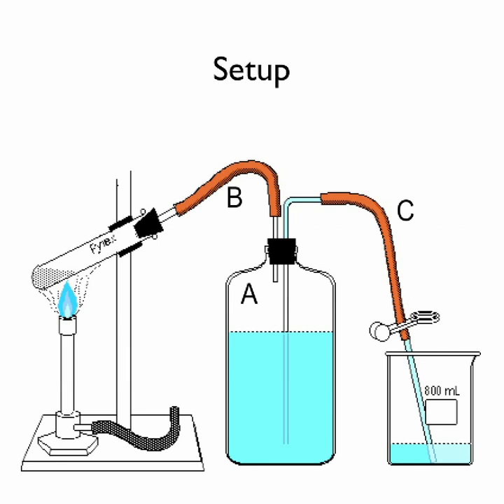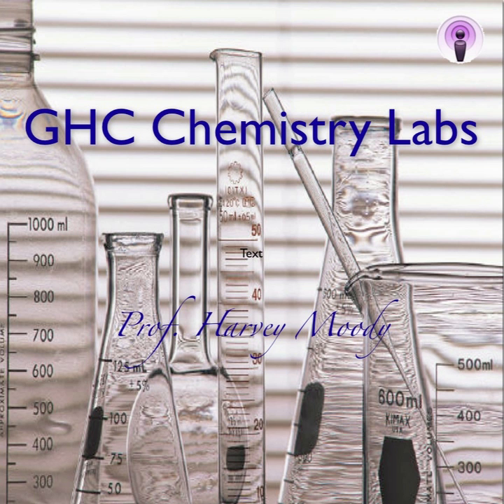To determine the pressure of oxygen, we need to take into account several factors. First, we will assume the total gas pressure in the collected bottle is equal to the atmospheric pressure. Second, since the oxygen is collected over water, the water vapor pressure will also contribute to the total pressure, according to Dalton's law of partial pressures. Therefore, the oxygen pressure is equal to the atmospheric pressure minus the pressure of water, which will be found in a table in your textbook.